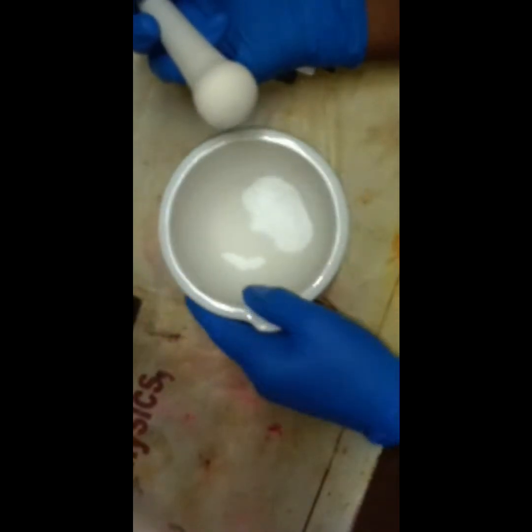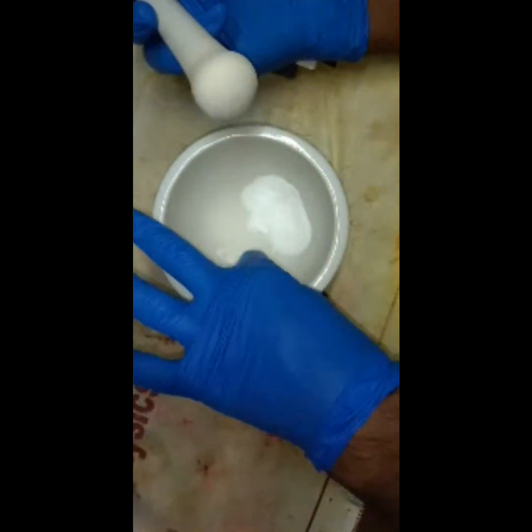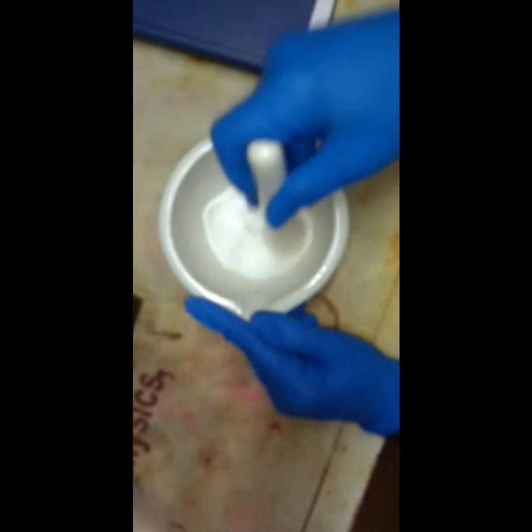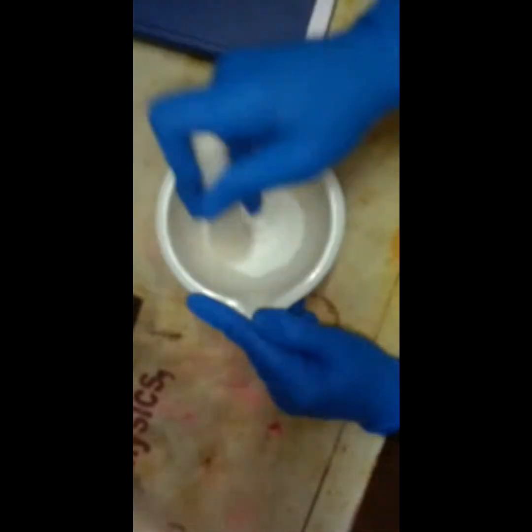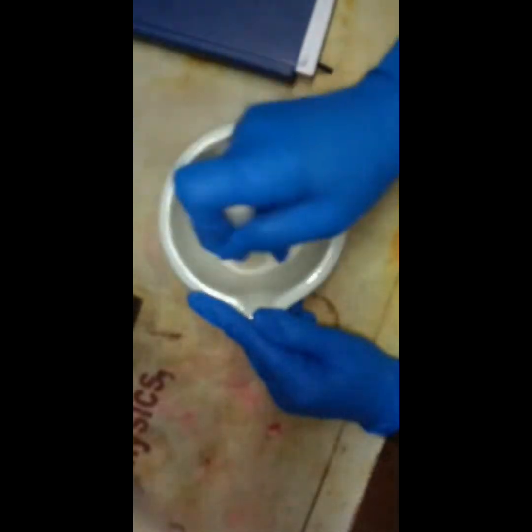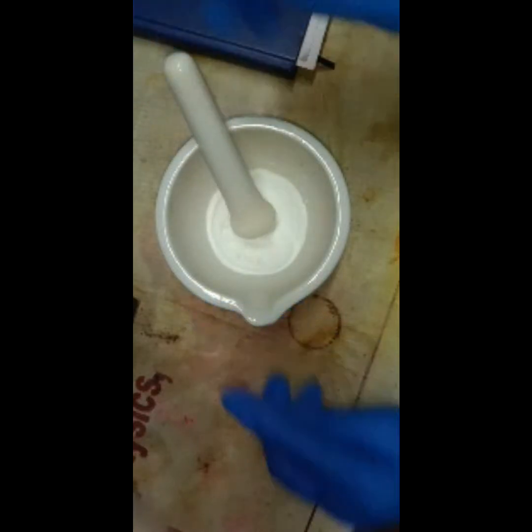You can see clearly the inside of the materials. The sample is ground slowly to improve the sample synthesis.